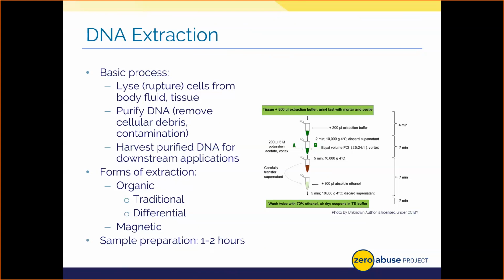So there's a little bit of trade-off here. The trade-off for organic extraction is we can get a lot of DNA, huge amounts, but the chemicals are dangerous to humans, and we might co-purify contaminants that could cause downstream issues with getting a robust profile. Magnetic extraction typically results in much less issues with contamination because we're doing all those washing steps, but we don't get as much DNA. So there's always that trade-off. Now, samples must often sit in what I call incubate. They've got to sit in that warm environment to ensure that the cells can rupture and that we maximize the DNA retrieved. So I'm going to be honest, extraction can take a few hours for a given sample. We often batch samples to maximize how many we run at the same time to help save you time on the turnaround.